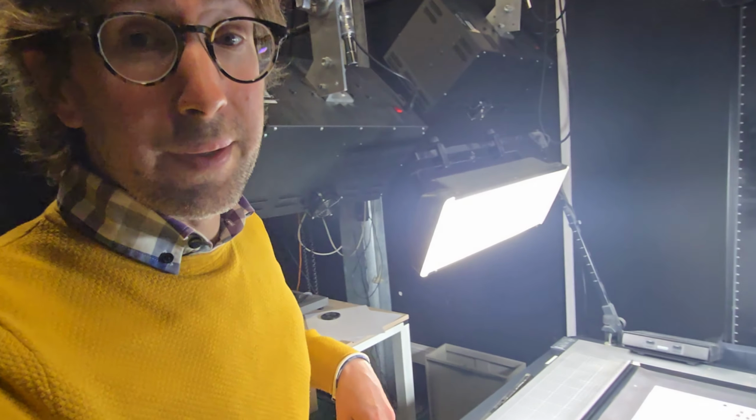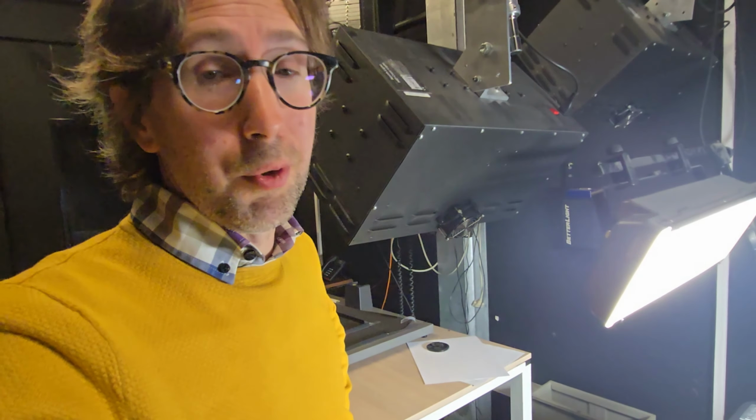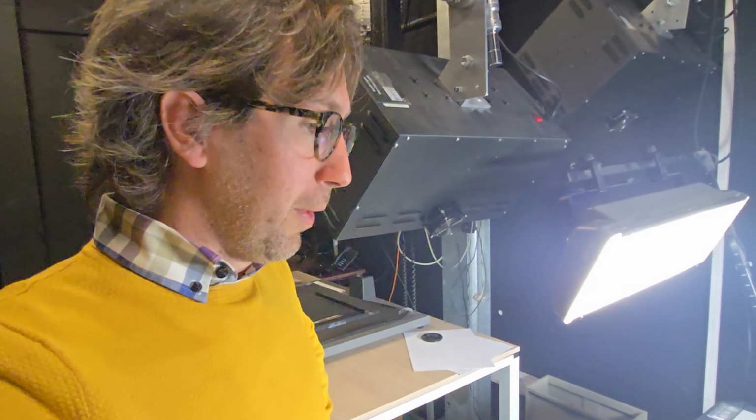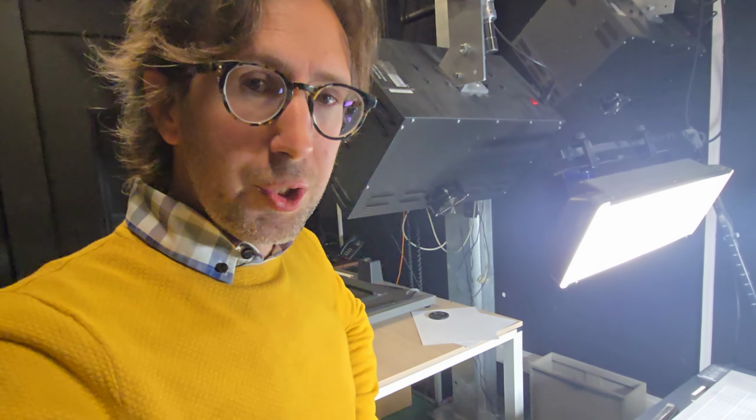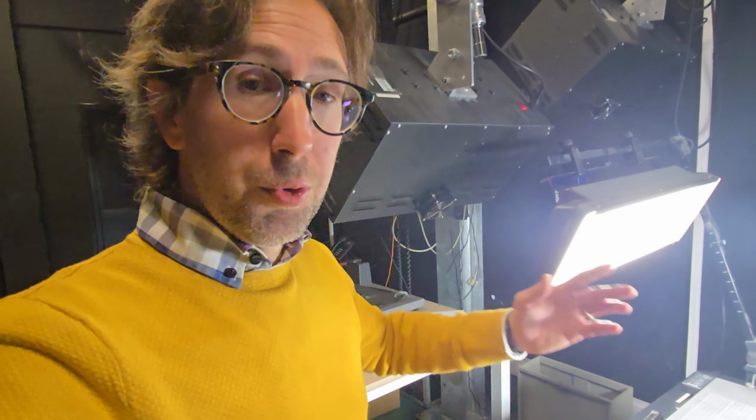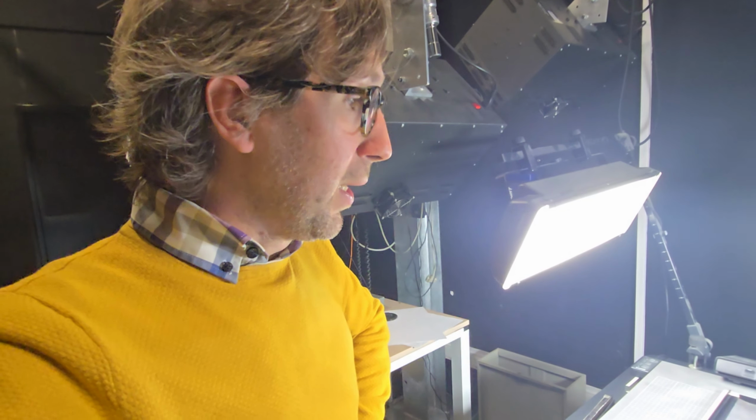So thanks for following this small clip on that. I will actually do another coding session in the near future to show you how you can use this script yourself if you want to measure the sizes of your own coffee beans, roasted or unroasted.